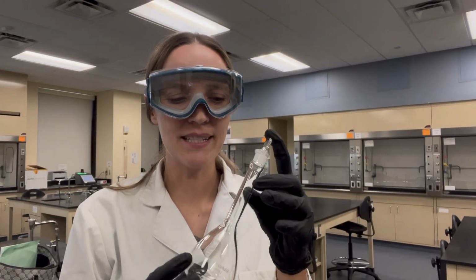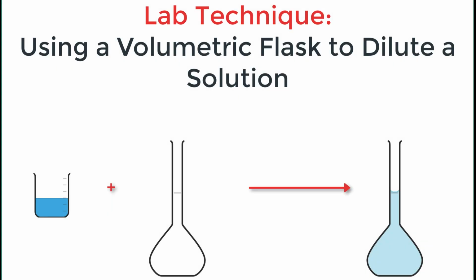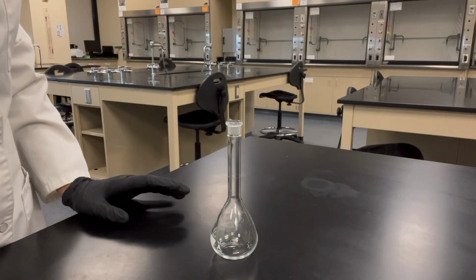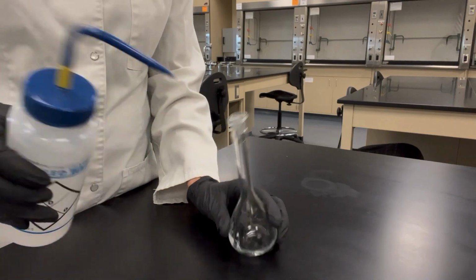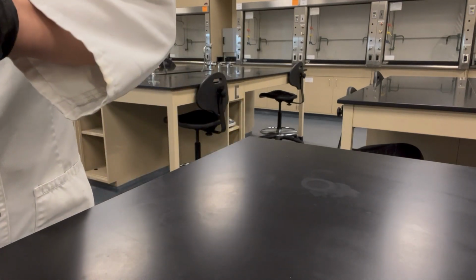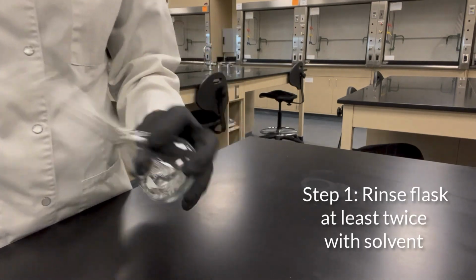This is a volumetric flask, and we can use it to create a solution with a very precise concentration. To create a more dilute solution, first you want to rinse your volumetric flask with whatever your solvent is. This is usually DI water, but if you had a different solvent, you would rinse your flask a couple times with the solvent.